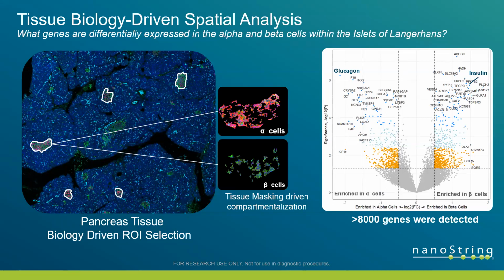So this is a great complementary tool to lots of different approaches. And where CosMx comes in is perhaps being able to array to define certain neighborhoods and look at certain high throughput screening approaches as well.